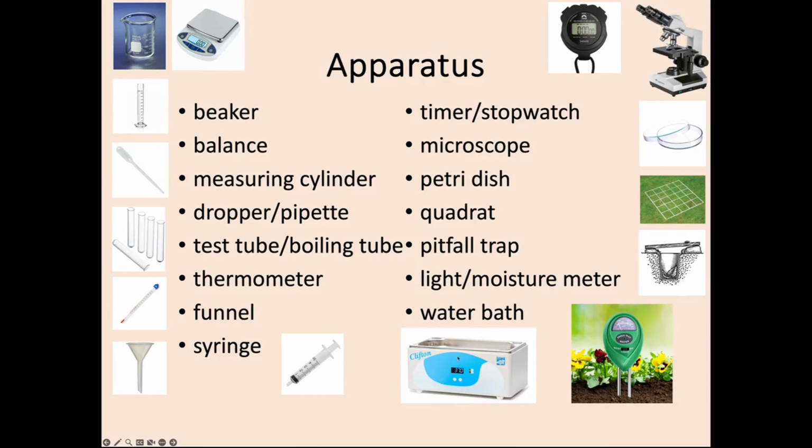And lastly, we've got a water bath here. Okay, this is a big water bath. Not very efficient water baths. They basically heat up water to a particular temperature and keep it there. It's useful if you're keeping, I guess, stuff at a constant temperature for a long period of time. It means you can control temperature in a solution that's in a test tube or something, because you can immerse the test tube into that water.